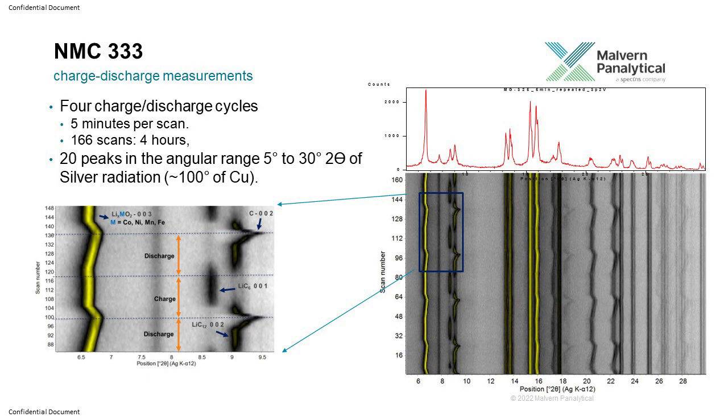In the case of NMC 333, they are doing it slowly, but once you have, say, NMC 811, you will immediately find that this lattice expansion is very rapid. And that is why NMC 811 chemistry is not stable. You have to really make some special design of this material to stabilize these particles. Otherwise, if you make it just like that in the lab without any design, then initial performance might be good, but after a few cycles, you will find that performance degrades.